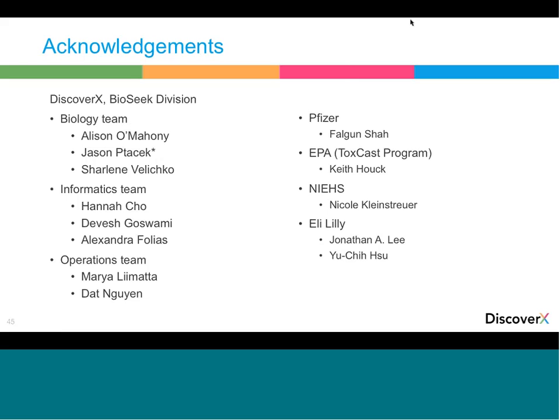At the time, we tried a variety of classification algorithms and methods: trees, random forest, and a few other methods. It turns out that these mechanism classes are quite well separated, so probably a lot of tools could work for this application. So I don't think there's anything special about support vector machine, but it turned out that it worked in this case.